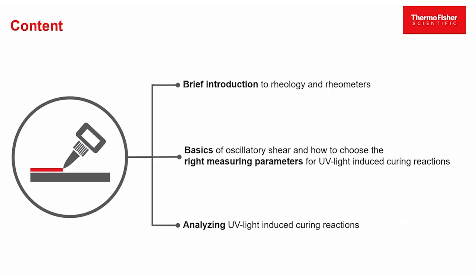Therefore, the second part of this presentation will focus on the basics of how to actually run measurements on UV light sensitive materials, but also about choosing the right measuring parameters for such experiments. Finally, we will connect all the dots by having a look at different UV curing adhesives we've investigated in our lab.